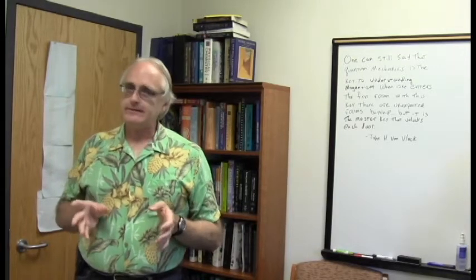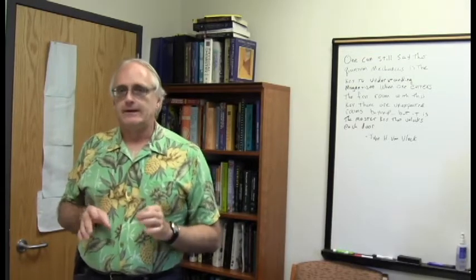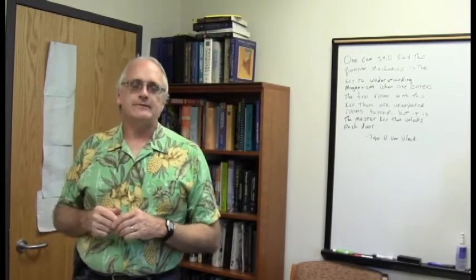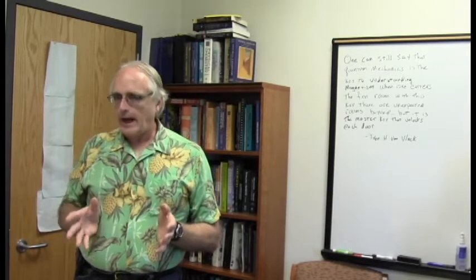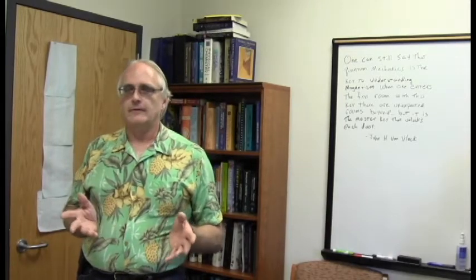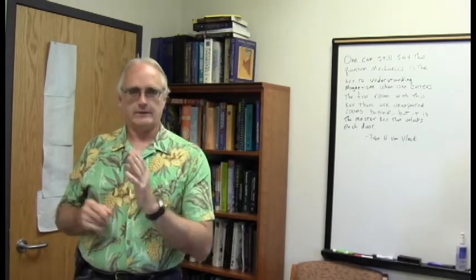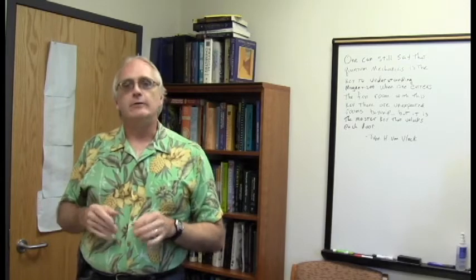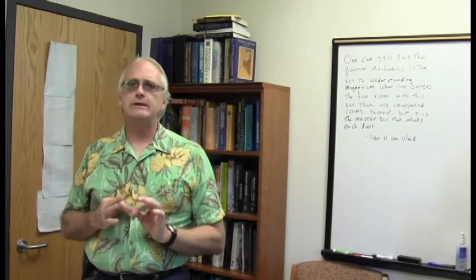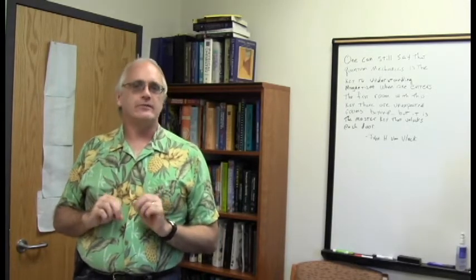If that's the case, then this is an indication that this molecule might have some symmetry in it. We're getting a fairly small number of peaks, only 4 carbons, for example, but in a molecule of 154 grams per mole, 4 carbons doesn't add up to much there. But if it's a symmetric molecule, then 4 carbons would really be a larger number of carbons, 7 if the axis of symmetry is on the carbon, or 8 if the axis of symmetry is on a bond between carbons. That's something to keep in mind. This is a reasonably good indication that this molecule may, no guarantee yet, but may have some symmetry in it.